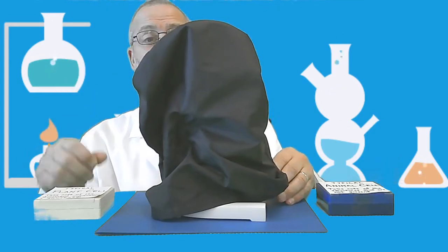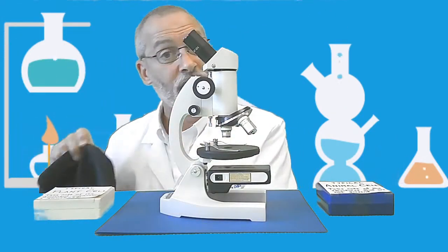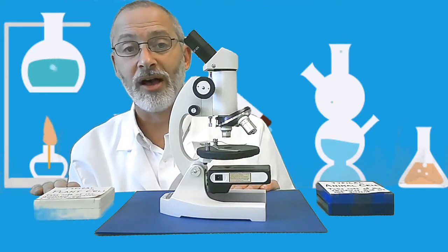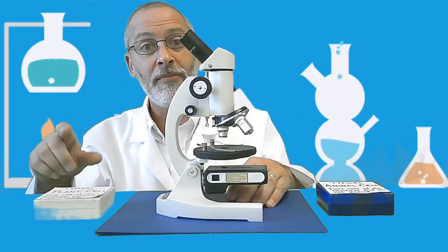Anyway, once you have obtained your microscope at your table, you are to remove the cover, which keeps the dust, dirt, and grime and the germs off of the microscope itself. And just a little refresher here on the microscope.